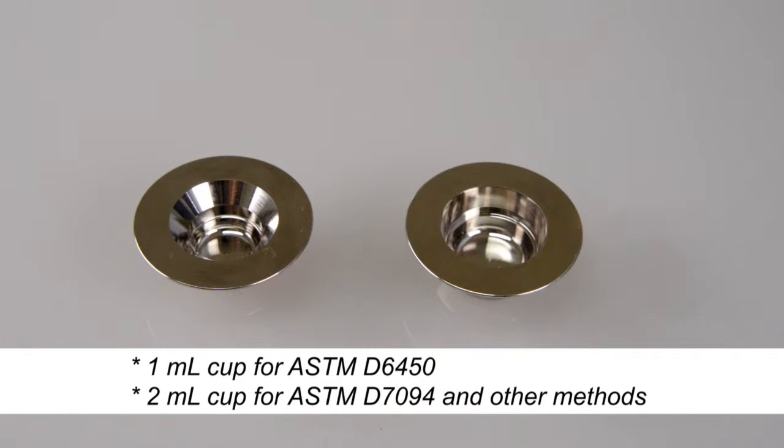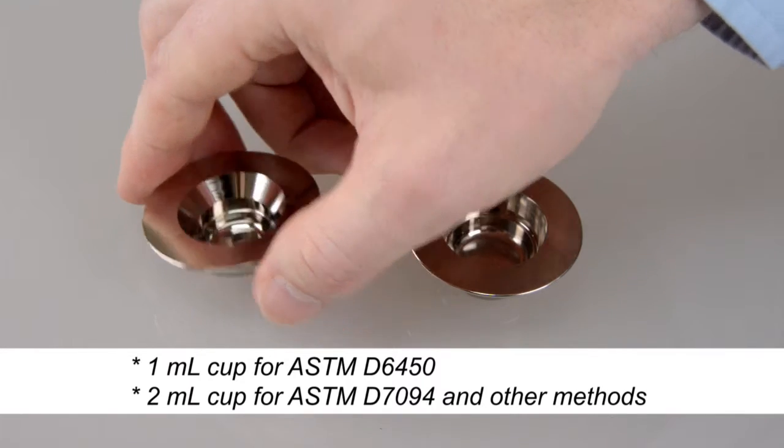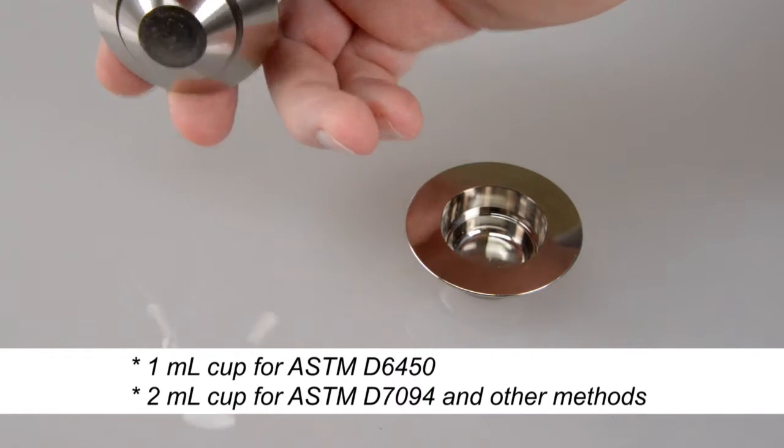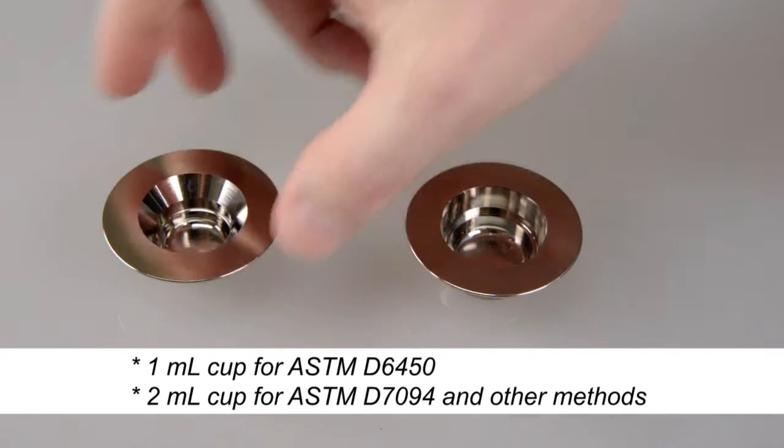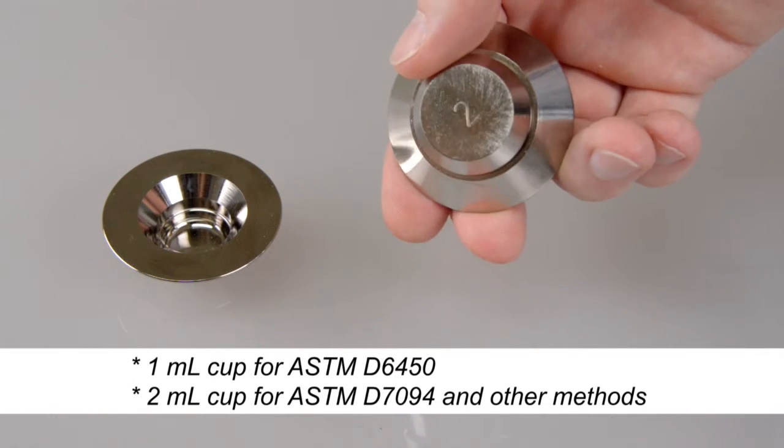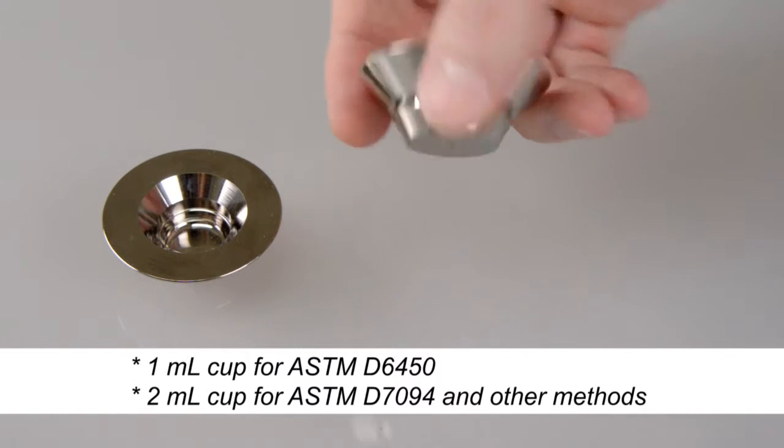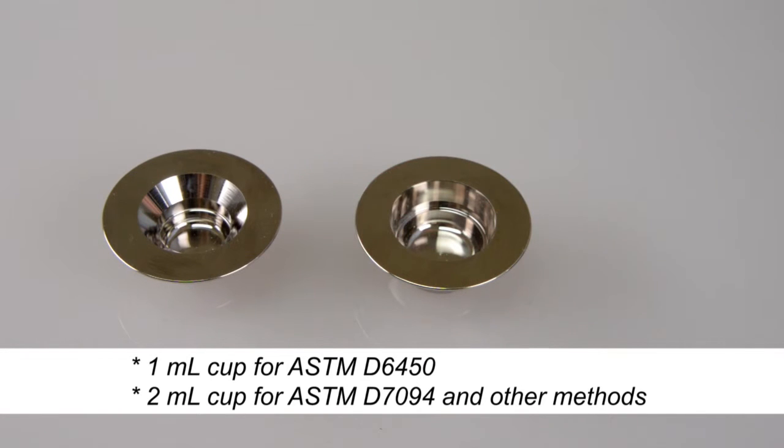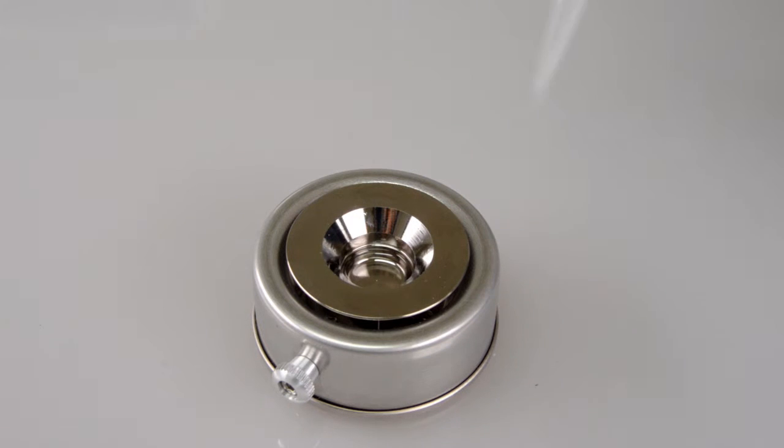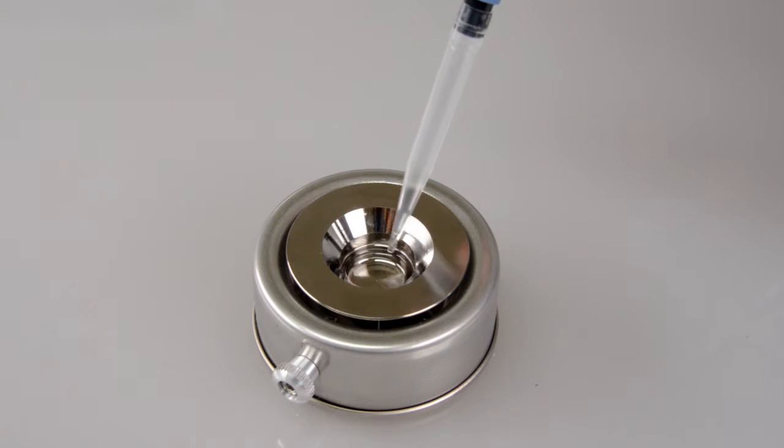For measuring, two cups are available: A 1-milliliter cup for ASTM D6450 measurements and a 2-milliliter cup for ASTM D7094 and all other methods. Keep samples cool before the test and make sure you fill the cup to the inner mark only.